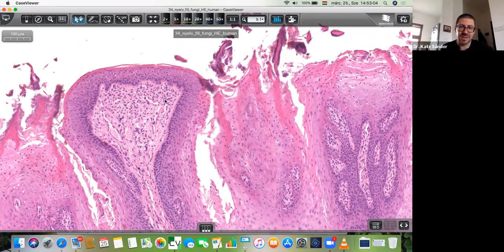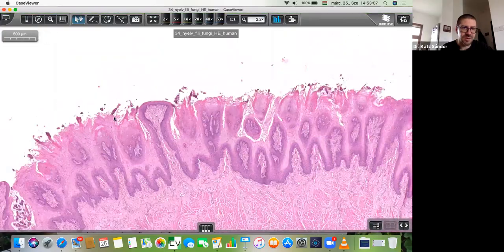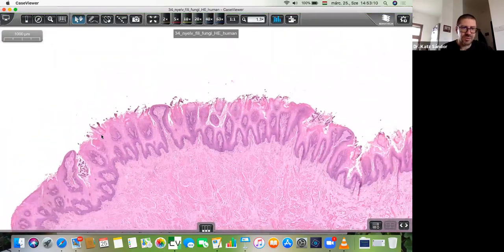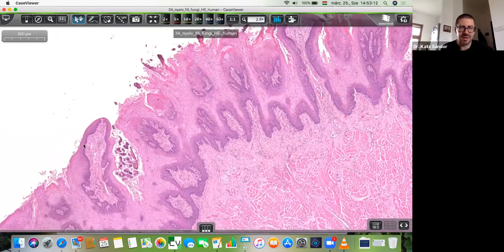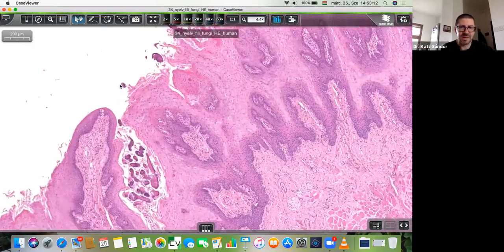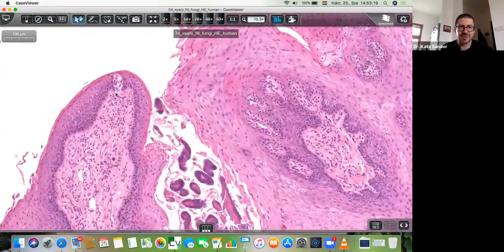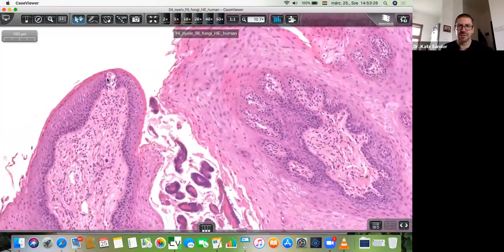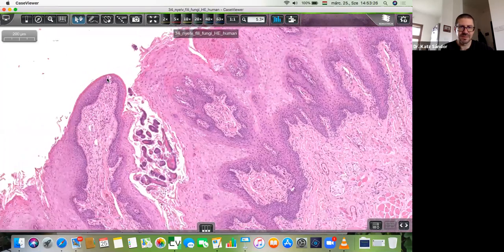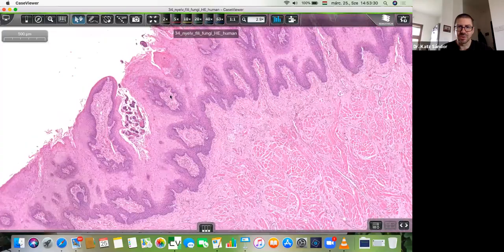Unfortunately, we can't see taste buds, but there is another one. It's also mushroom-shaped, but a little bit elongated as well. Here at the top side, there is a taste bud. This is a taste bud. So this is a fungiform papilla, and this is a typically shaped one.